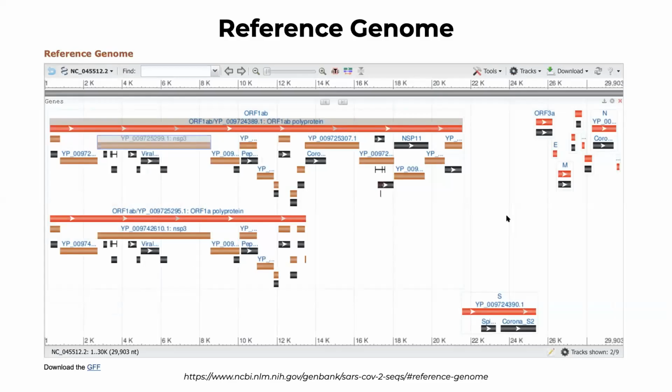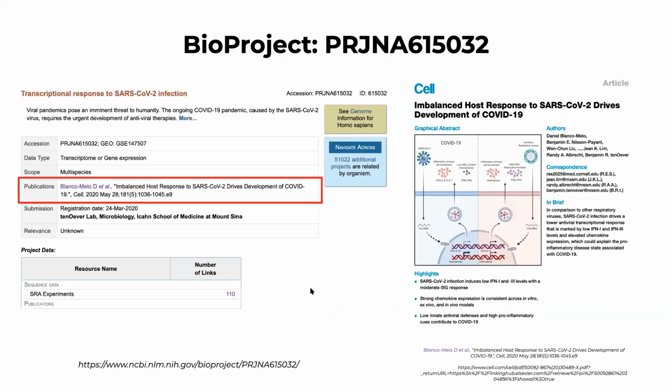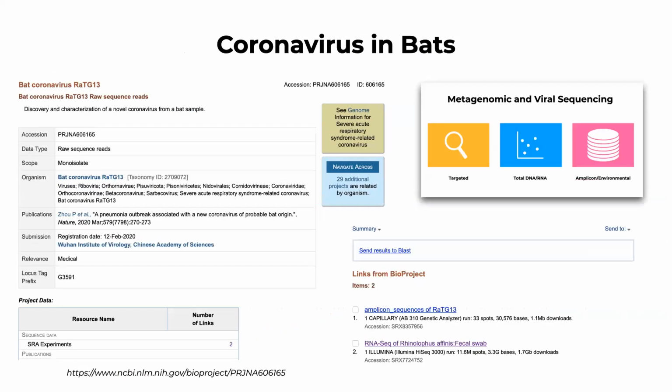And here we see the different genes of the reference genome. That type of annotation helps us understand which genes have more coverage in terms of that COVID-19. And we discussed finding these different types of data sets on SRA and understanding how they were sequenced and understanding what exactly we can find in human, for example, cell lines, right?